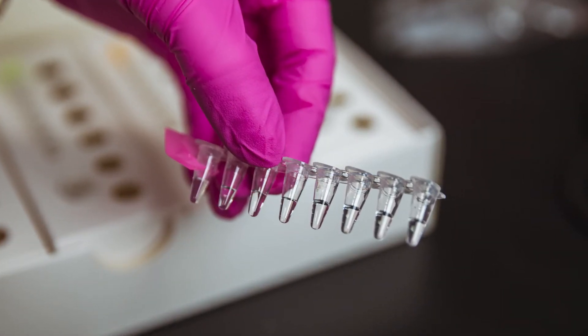PCR machine prices increased significantly during the pandemic period. That's why FRANKT users have the option to choose cheaper versions of thermocyclers and adapt them for FRANKT purposes.